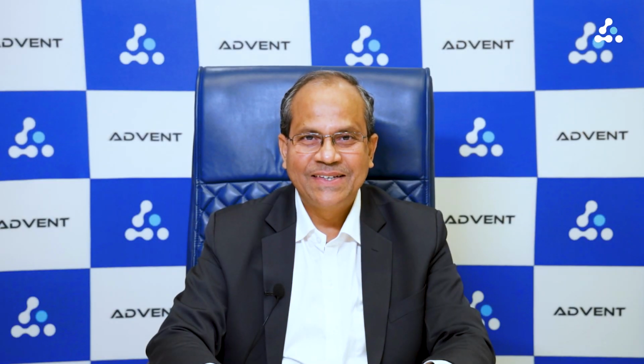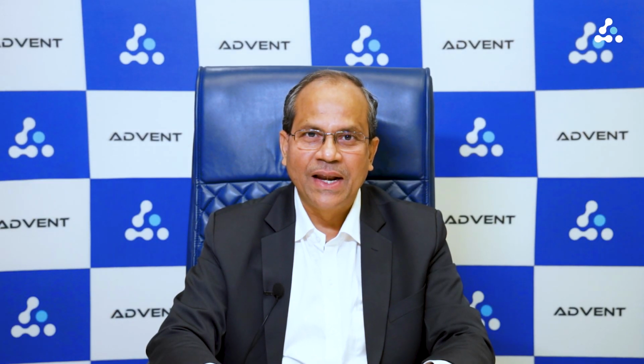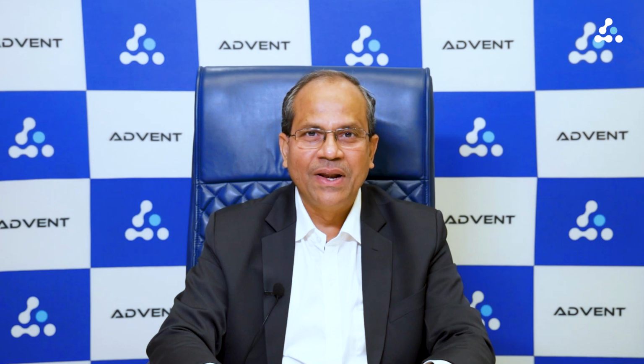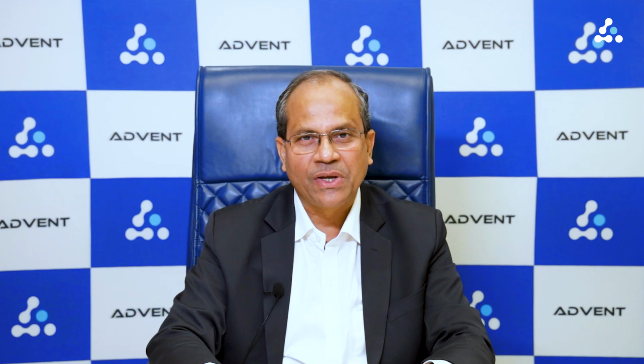Welcome back to Advent. Today I will be taking up the fascinating subject of eluent additives used in liquid chromatography grade solvents. Whether you are a seasoned chemist or just a curious learner, this video will help you understand why additives are used and what categories of additives are used in liquid chromatography applications.